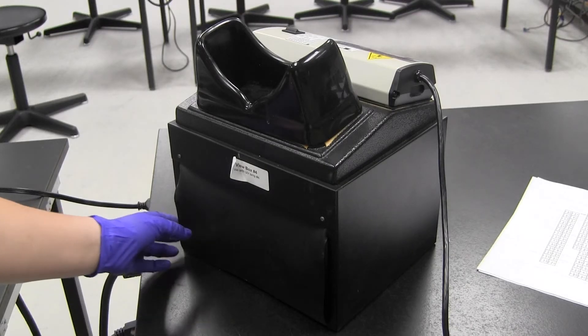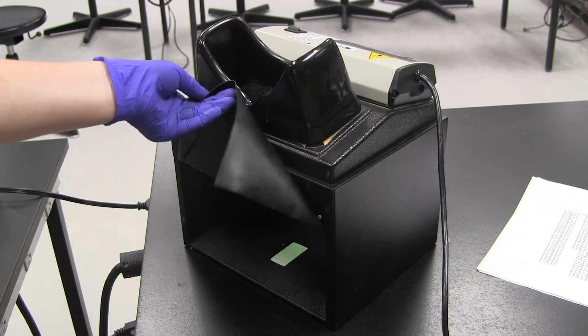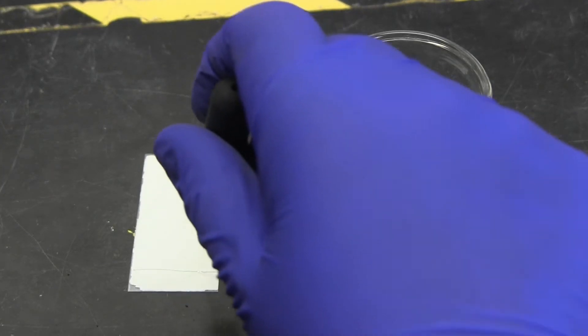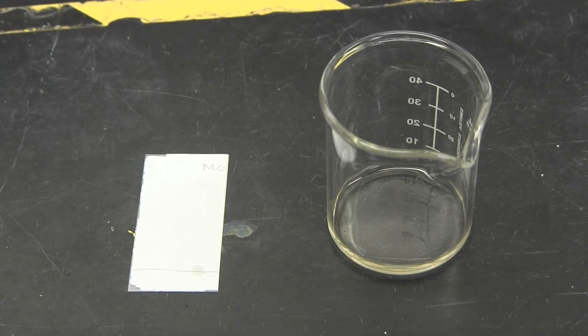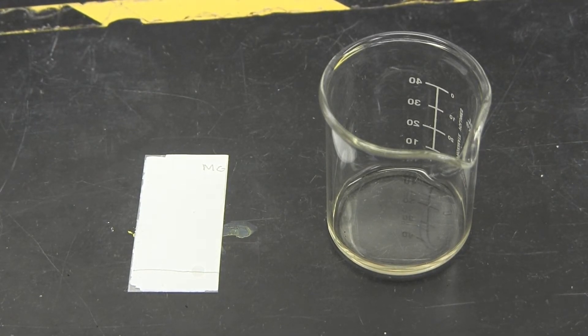Look at the plate under UV light to make sure you have enough unknown on the plate before running it in the TLC chamber. If there is a noticeable dot under the UV, you are ready to test your TLC plate. If you cannot easily make out the dot, place more of your unknown on it using the capillary tube. This is a plate with too little unknown, and here is one with too much unknown.